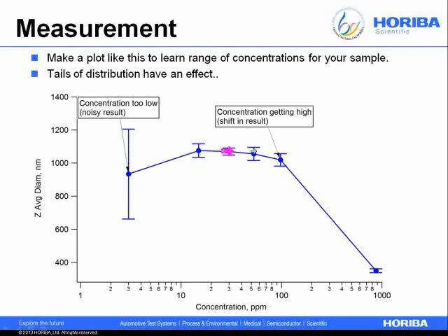So these all have about the same measured size. Now we get to this higher concentration, you start to see this measured size go down. Now the size of these particles is not changing. So what's changing is the measured size of the particles.